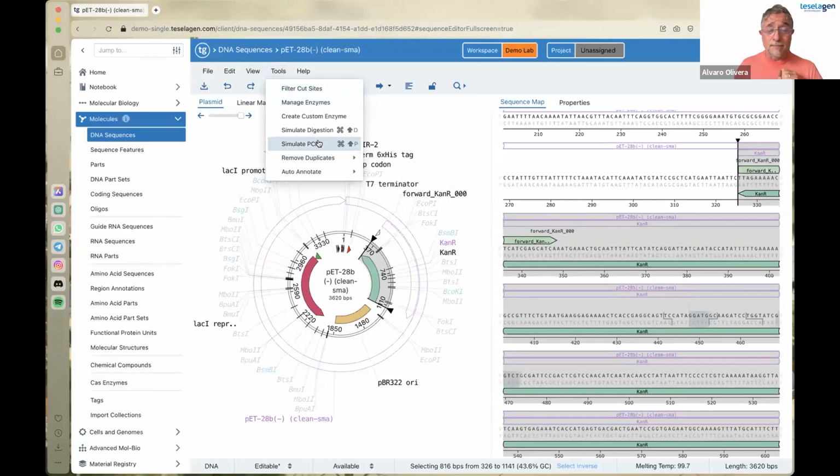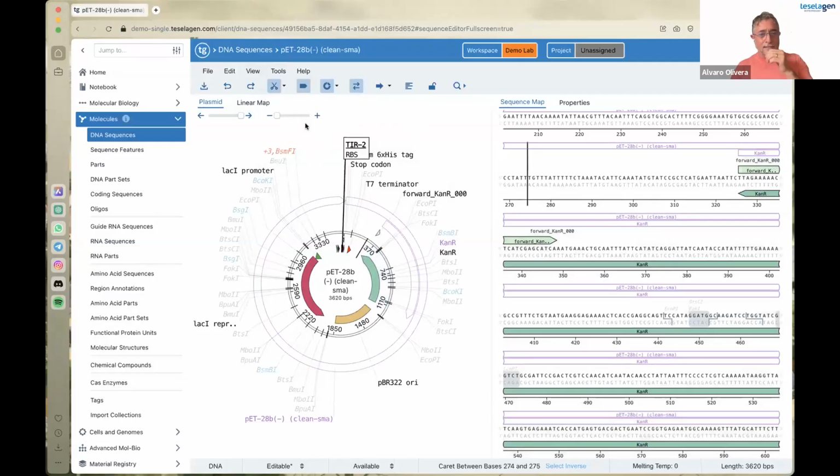I'm sorry because probably I deleted my reverse primer here, but just to show you what kind of tools you can use, I introduce you to the PCR simulation tool. If you selected different kinds of primers, the primers should all be annotated on your sequence here. In this case, I just selected 1 primer pair, and it's the only one I have.